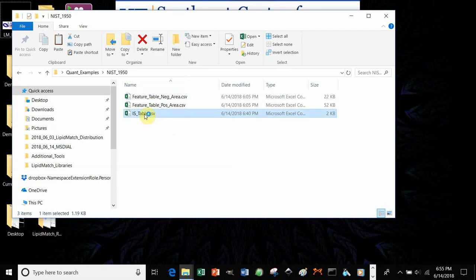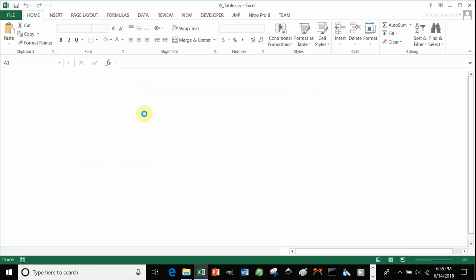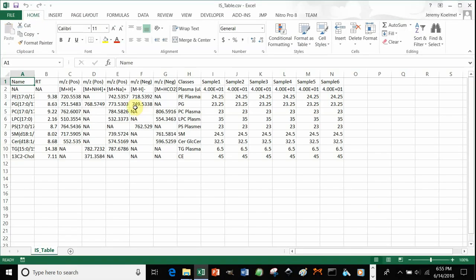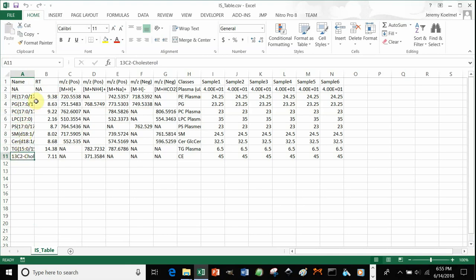The internal standard table you're going to have to generate yourself for LipidMatch Quant — this will probably be the most time-intensive part of using LipidMatch Quant. In your first column, under 'name,' starting at the third row, you would start to type in your different internal standards. You can name these however you want; this is for your own use, and it will show up based on the internal standards that were used to quantify each feature.